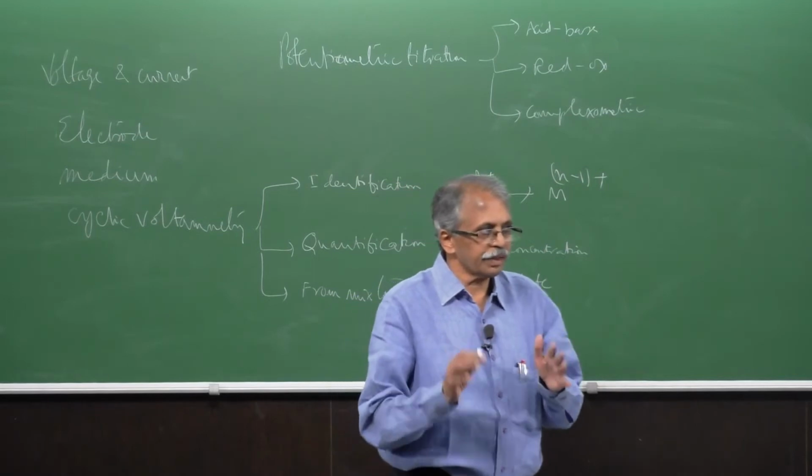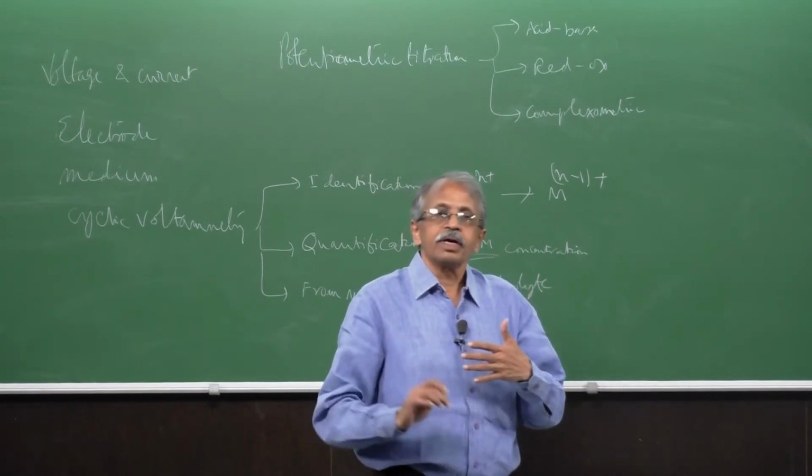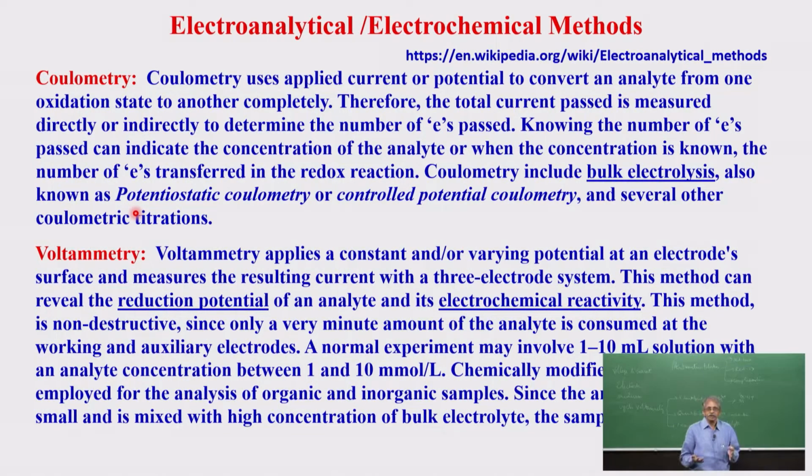For the time being, let us take that. So, if you can separate this, you can get back your species, but since you are using very small concentration, you do not need to look for separating that one, and also you do not require huge electrodes, etc. You can have very small micro kind of electrodes, which are good enough for doing that too.